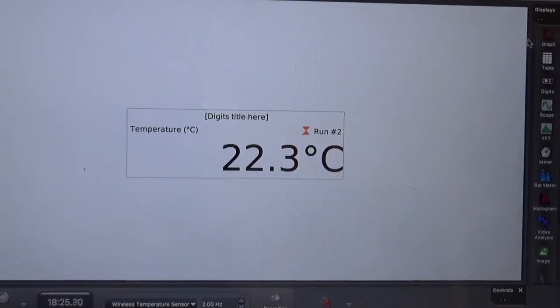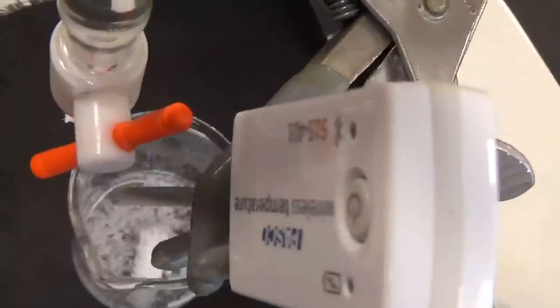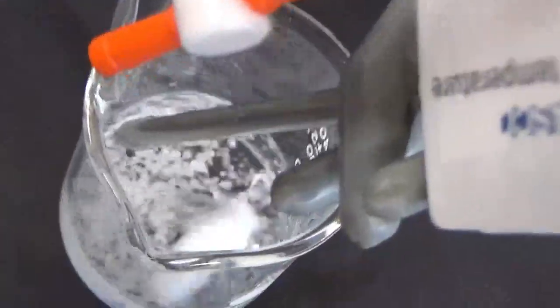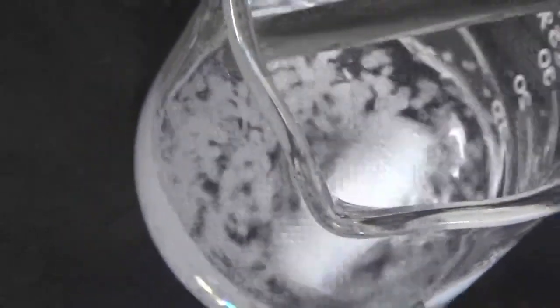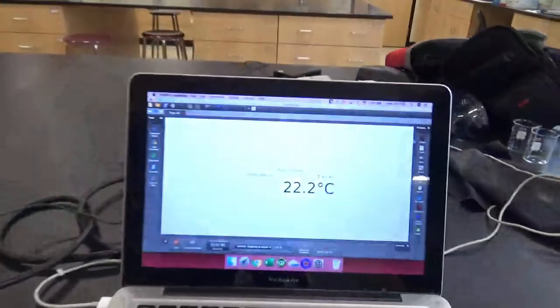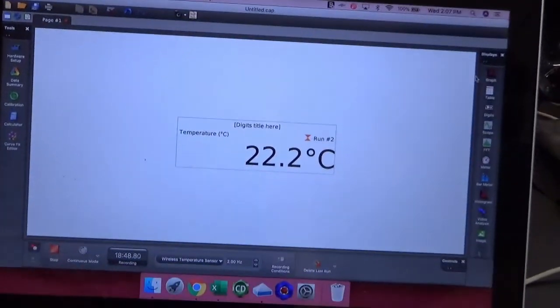Is there any angle we could get that? From the top, maybe. Oh yeah. Oh yeah, look at that. You can really see individual crystals. Glad I did that. Looks like fewer than before. Yeah. Oh, thank you.